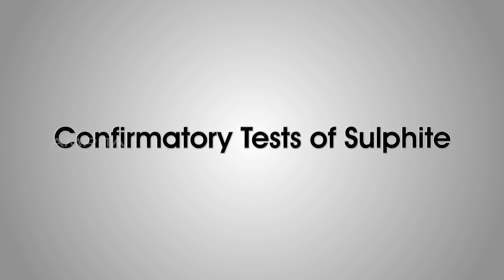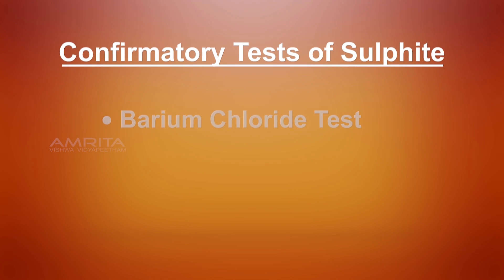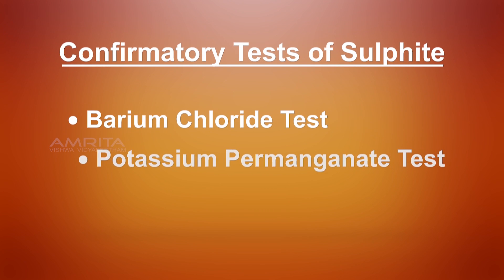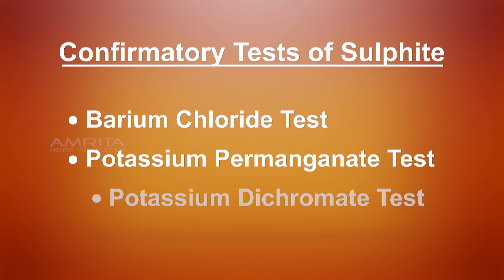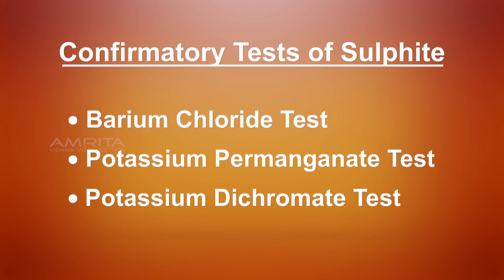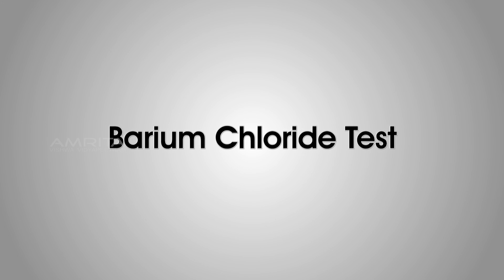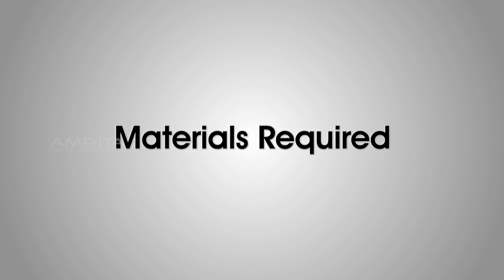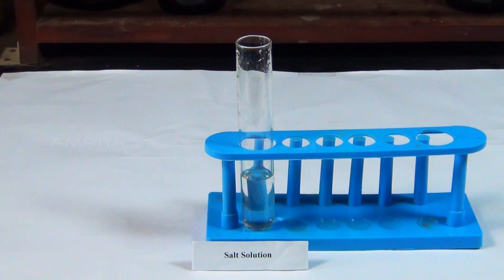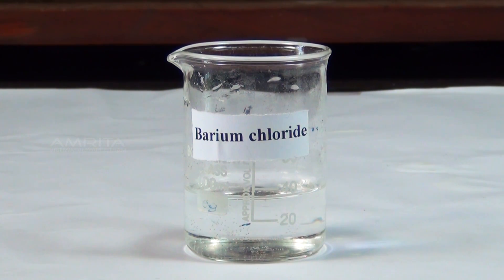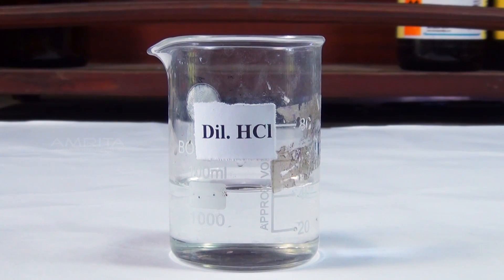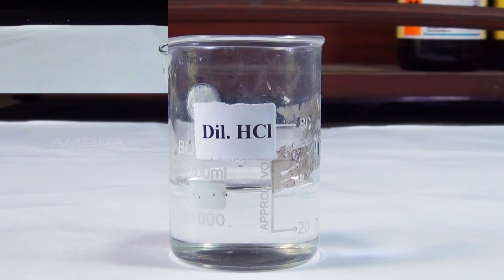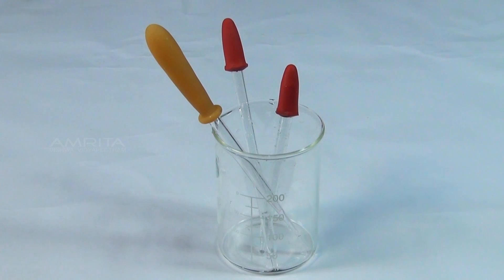Next, we look at the confirmatory tests of sulphite. The confirmatory tests are the Barium Chloride Test, Potassium Permanganate Test, and Potassium Dichromate Test. Barium Chloride Test. Materials Required: Aqueous solution of the salt, barium chloride solution, dilute hydrochloric acid, test tubes, and droppers.